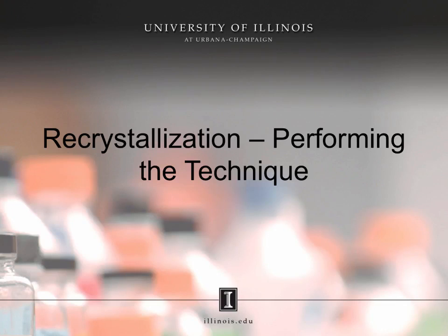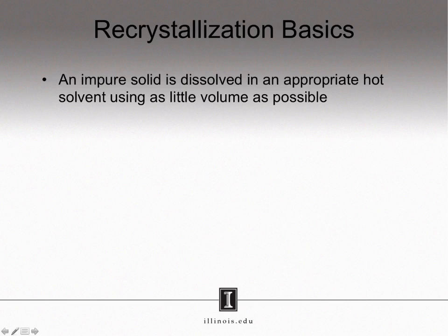Recrystallization, performing the technique. In this webcast, you will discuss the thought process behind performing a recrystallization. Depending on what kinds of impurities are present in your compound, you will utilize different techniques. Mechanically, a recrystallization is quite simple.